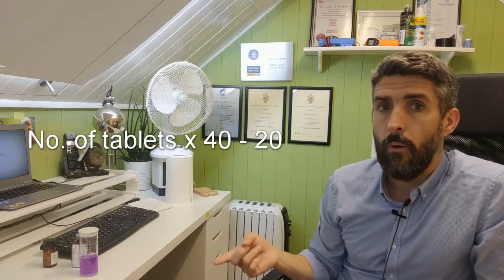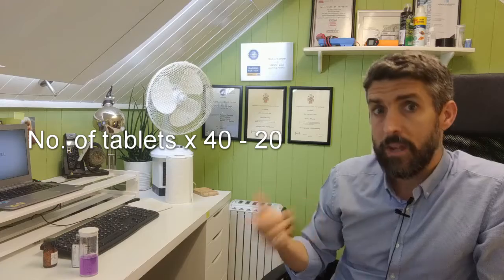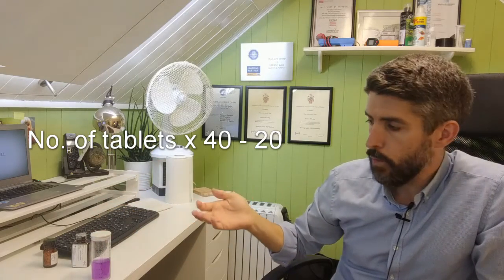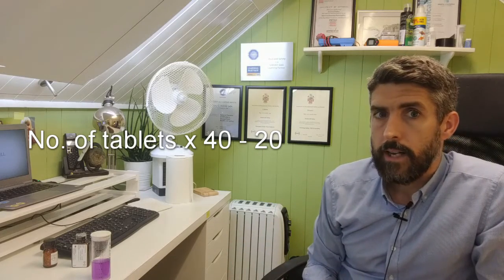So the idea now is to use a formula to arrive at the actual calcium hardness value. The formula to use, if you're using a 50 ml sample, is the number of tablets, which in this case was 4, multiplied by 40 and then minus 20. If you were using a 100 ml sample, you would multiply the number of tablets that you use by 20 and then minus 10. But in this case, we've used only 50 ml. So number of tablets multiplied by 40. We used 4, so that's going to be 160. Then minus 20, which would be 140. So our calcium hardness level is 140 parts per million.